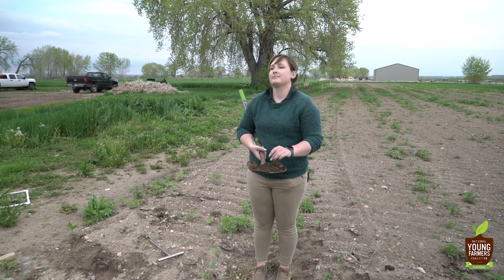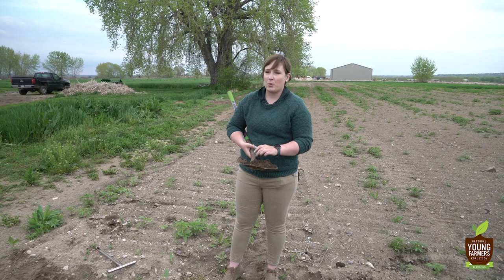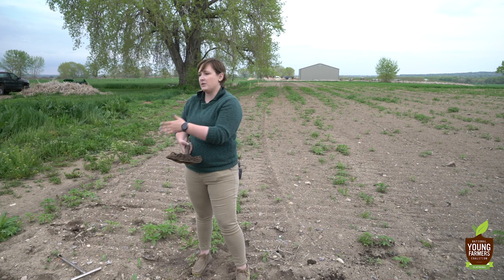Okay. So CSU does have soil sample bags, which I did not grab because it did not go on the list for the week. They will have a line on them that says fill line, and you typically need to get that at least 2/3 to 3/4 of the way full. For different tests, they might have different requirements for the amount that they need. For soil fertility, you can typically just send a cup to 2 cups. That will be enough.